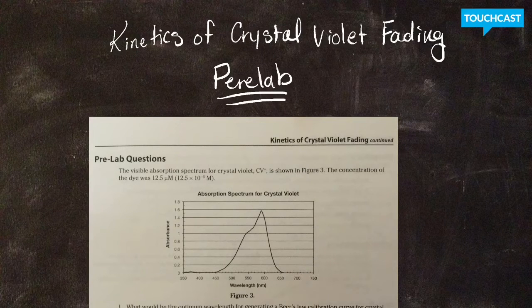I do apologize for not being able to have that very first day of school so that we can go over this lab. So I hope this video does a good job at just helping you out where I can. So anyway, let's take a look at the pre-lab for the kinetics of crystal violet fading. So pull it out, let's take a look.